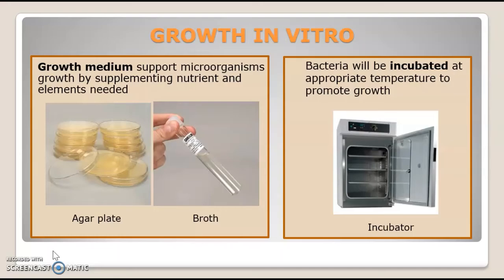The growth medium is a medium that provides nutrients and supports the growth of the microorganism that you are culturing. Typical examples of growth medium are agar plate or nutrient broth.